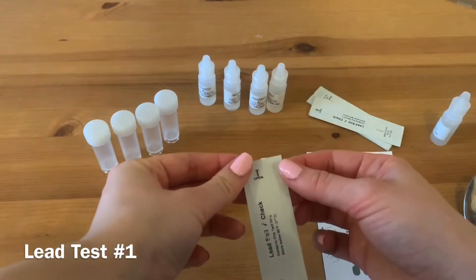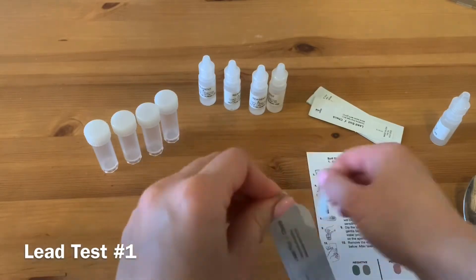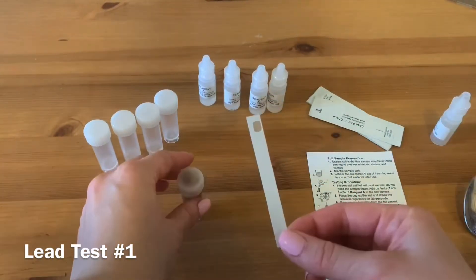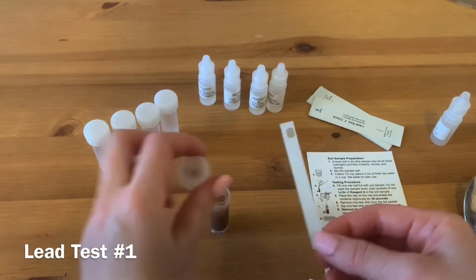Remove one test chip from the foil packet. Dip one test chip into the vial for 5 seconds.